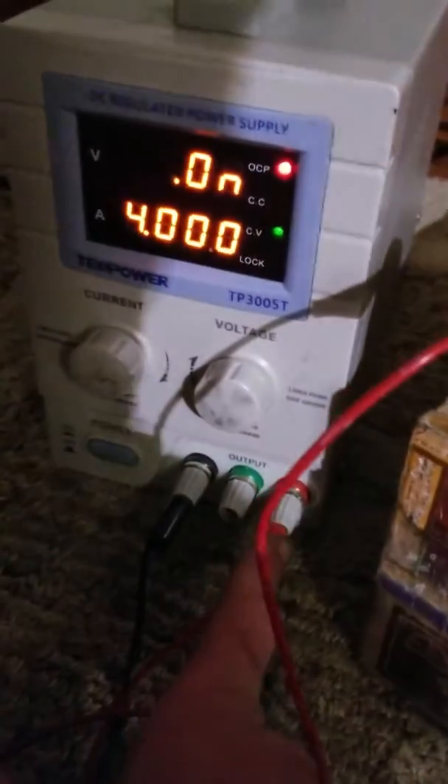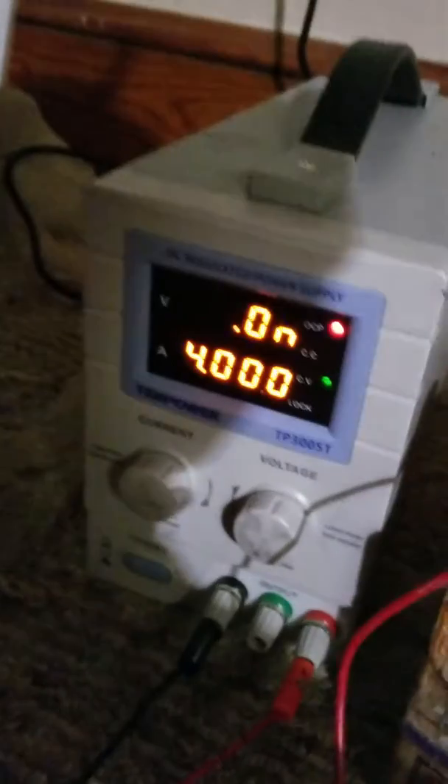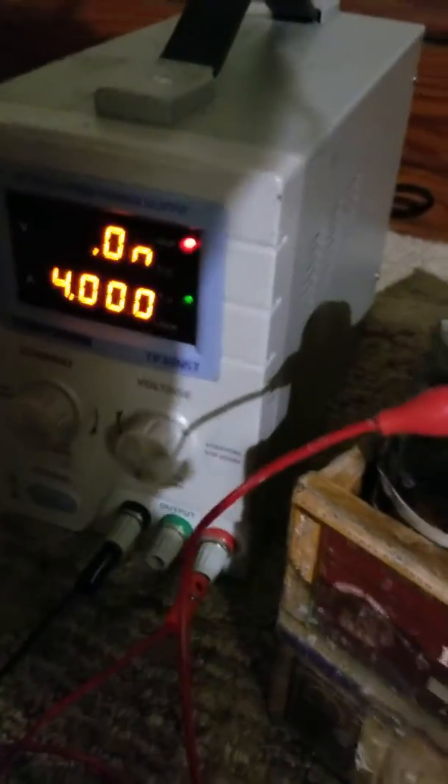Let me just show you my rig here. You see right here, you have the negative power and the positive power hooked up to my power supply. You can use any DC power supply, just make sure that it's got a high voltage and a high amperage, because the higher the voltage and amperage, the faster the experiment will go. Also, these electrolysis experiments are notorious for taking forever to do.